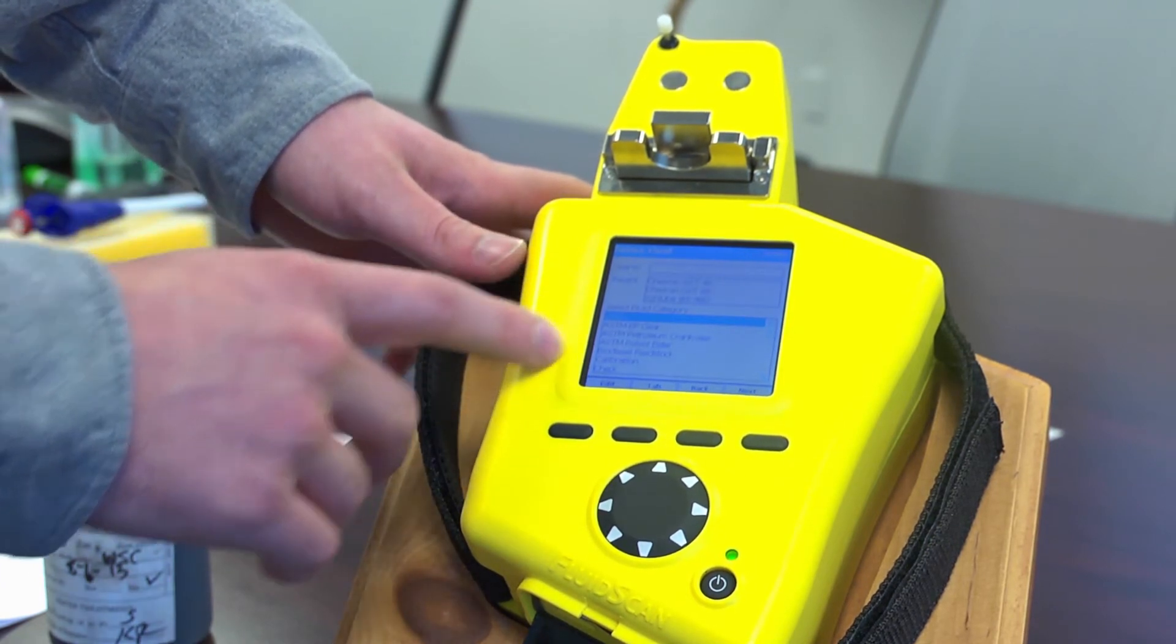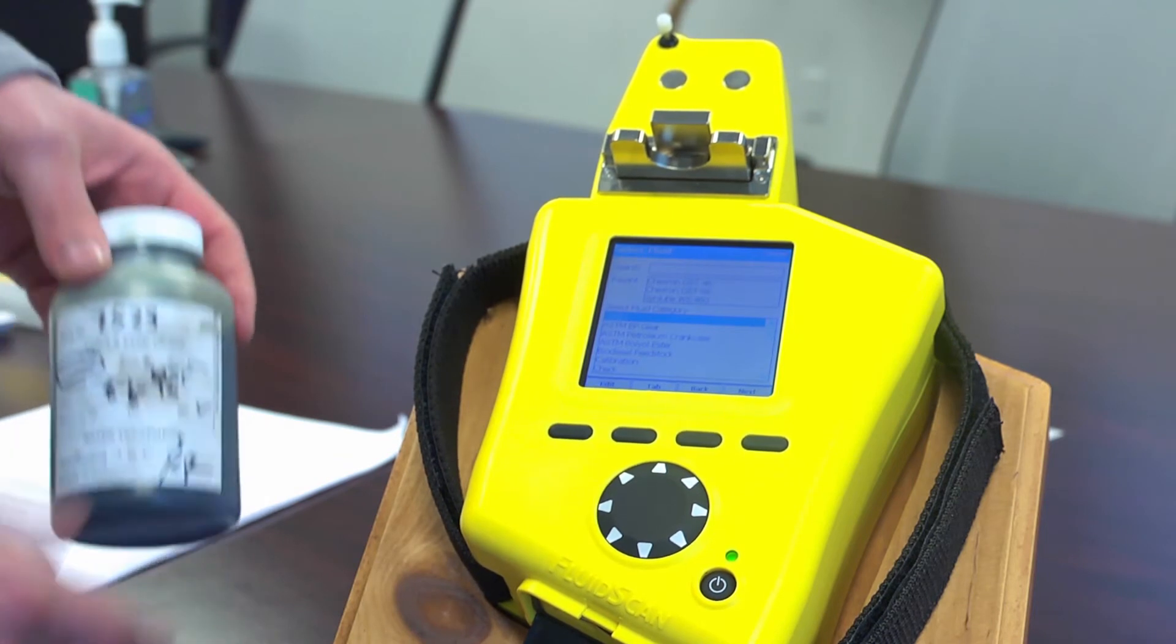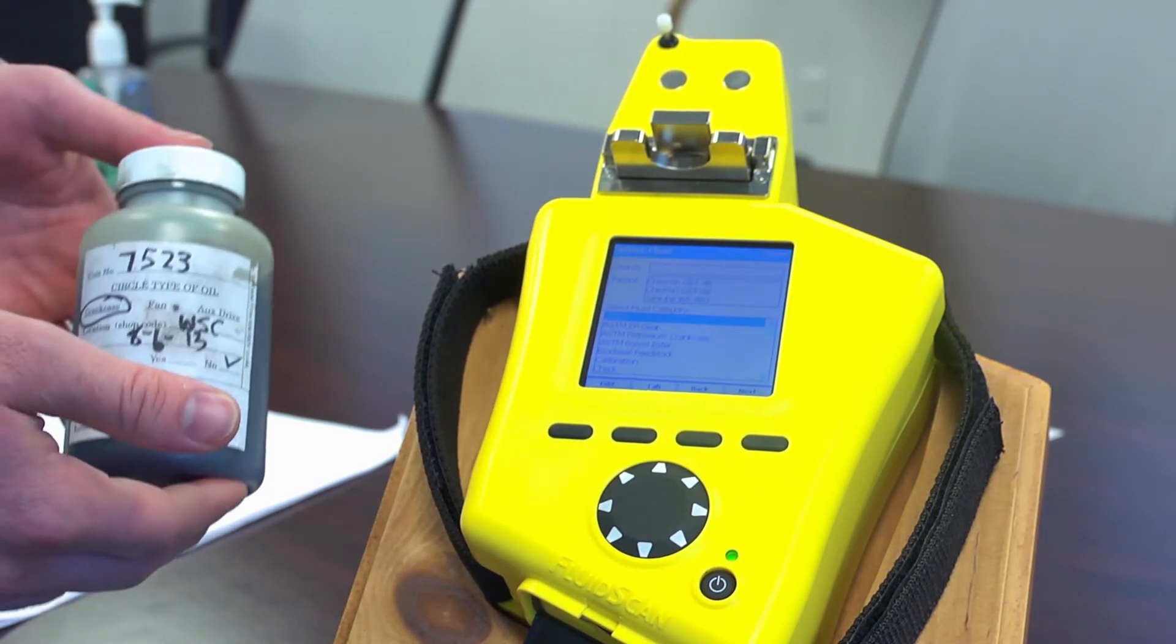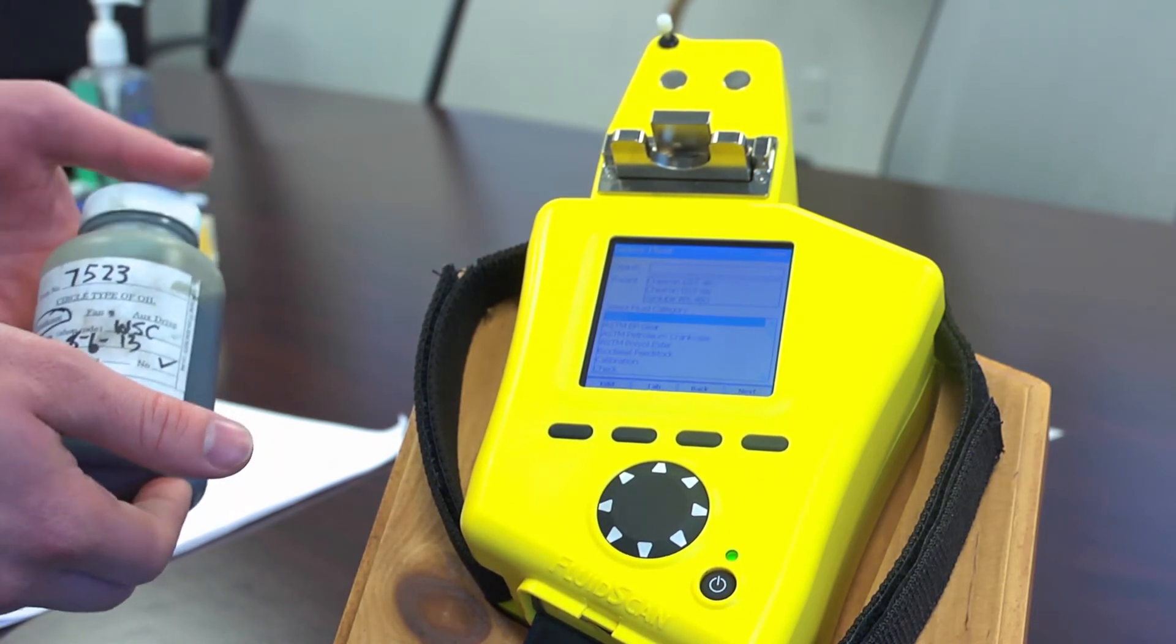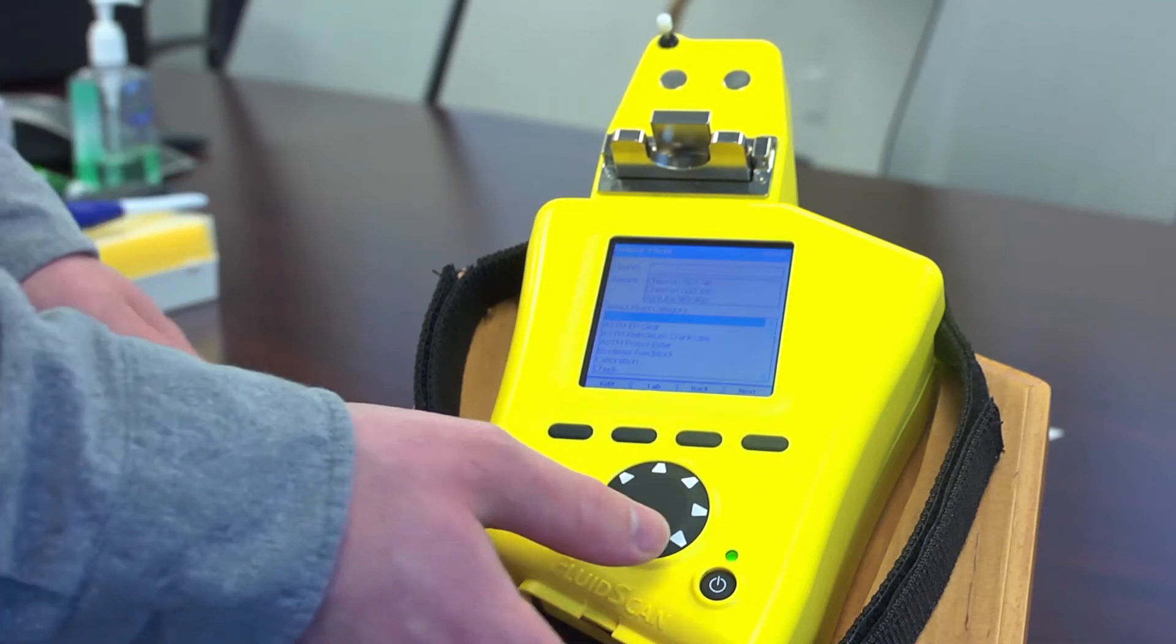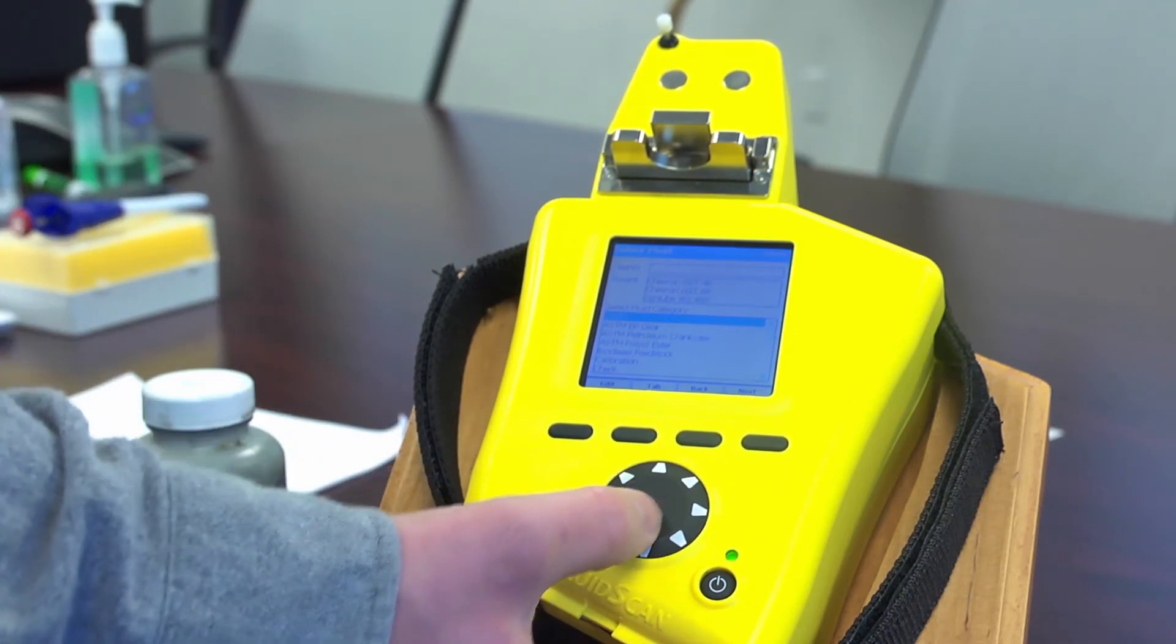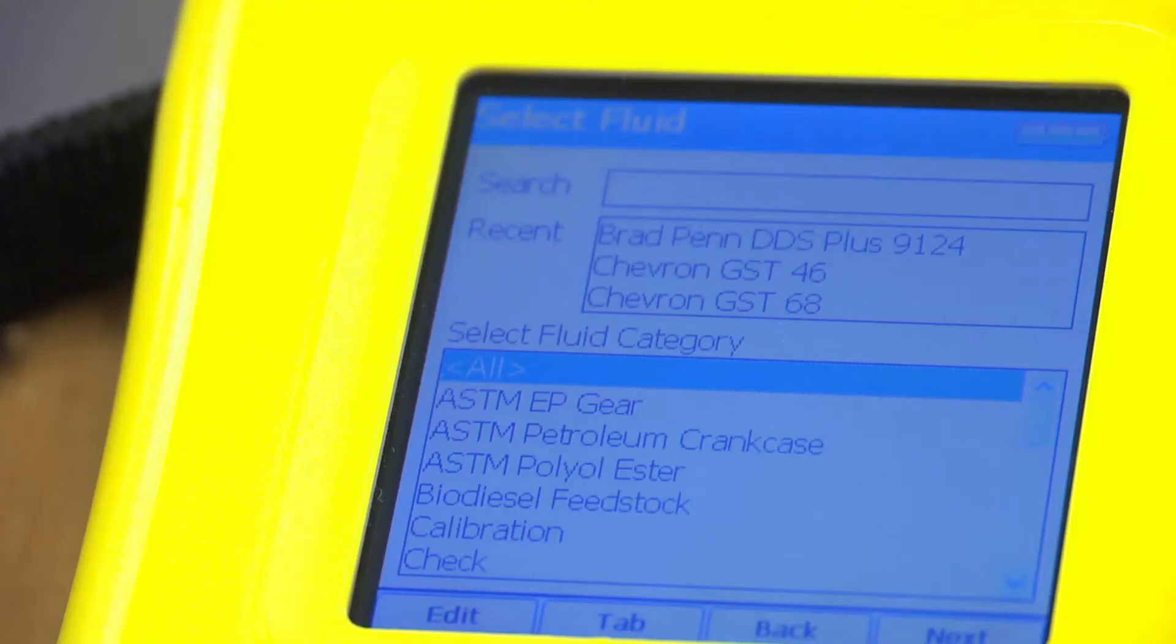It will prompt you to select the fluid that we have. This is a heavy engine oil that is used in locomotive industry. Before using the fluid scan, it is best to know exactly what you are measuring against as it does compare the spectra between known fluids.